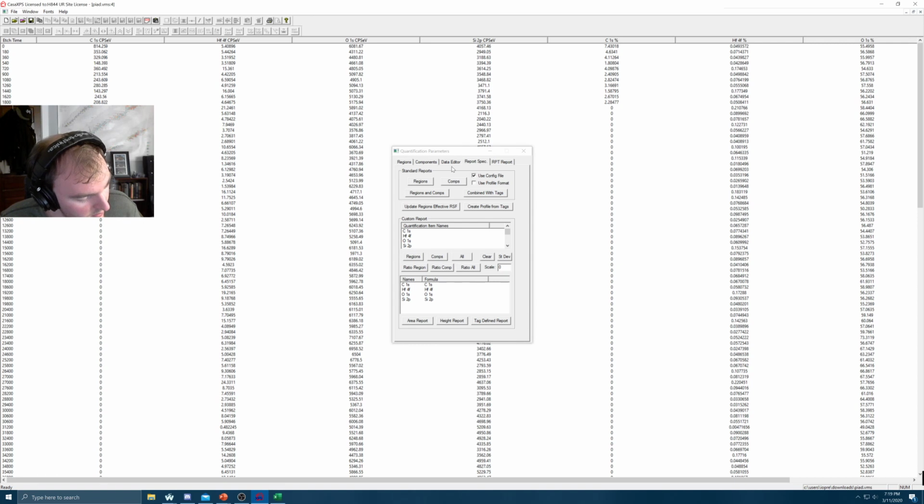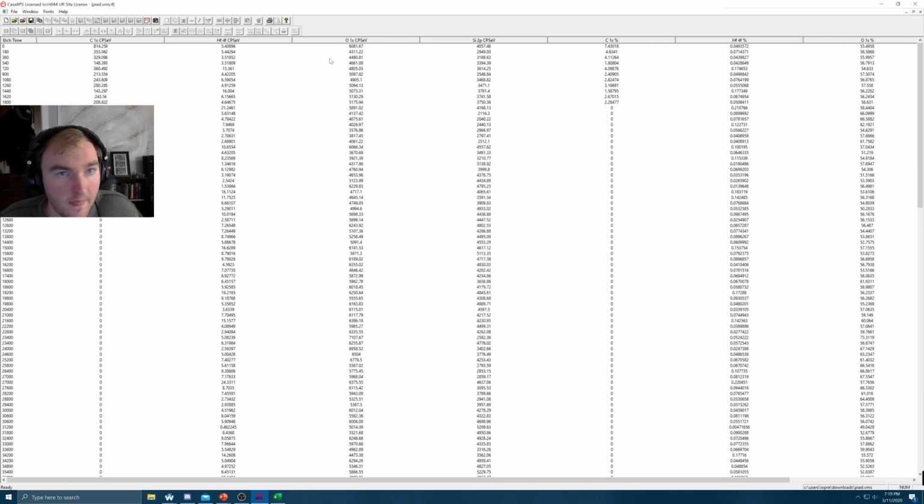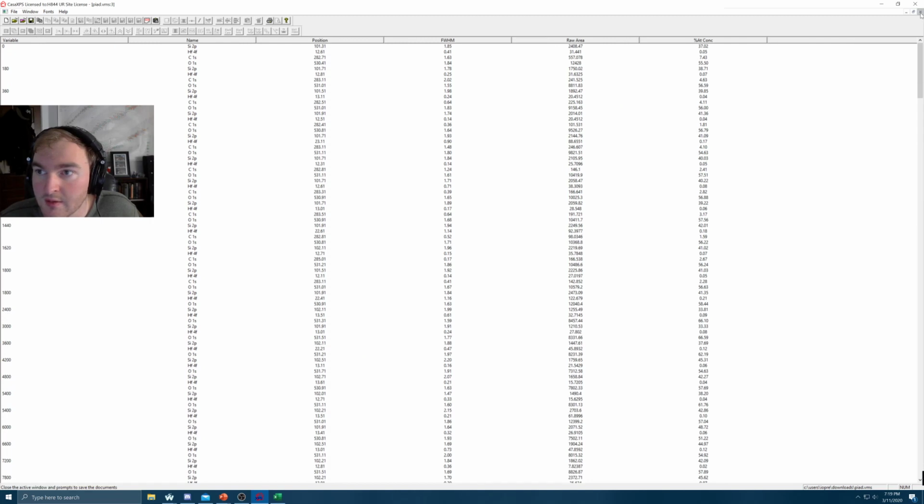Okay, so that is all I had to say about generating reports from etch test data. I'm going to exit out of these for now.